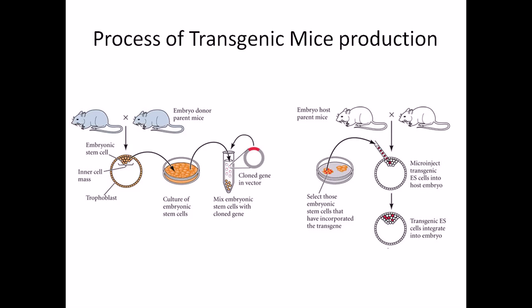And then, as you can see here, the new embryonic stem cells are designated with the red coloration, right? So after that, the stage will be like this. So we have this mouse now. This is the recipient mouse. So we need to inject all those embryos.